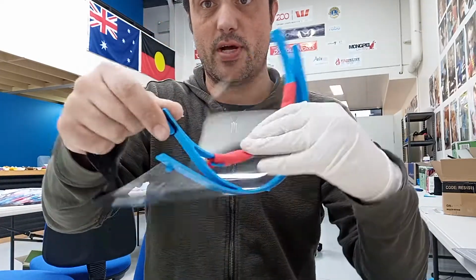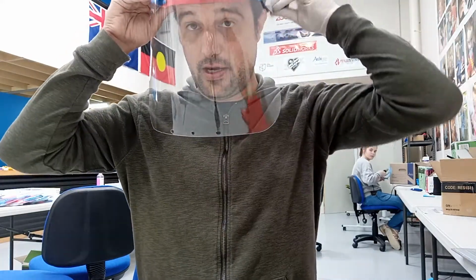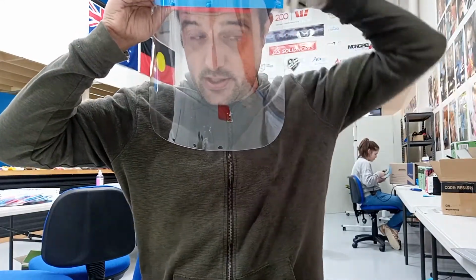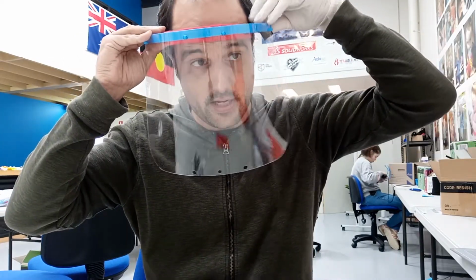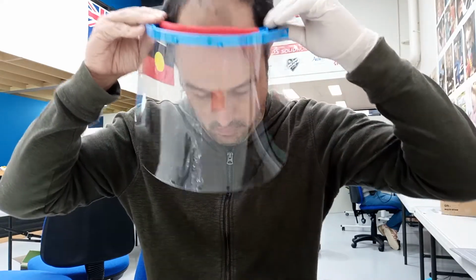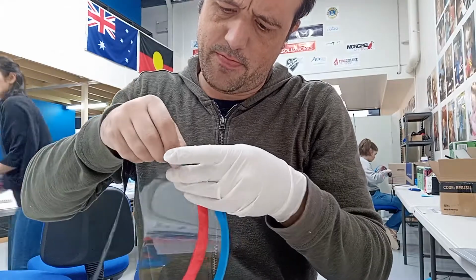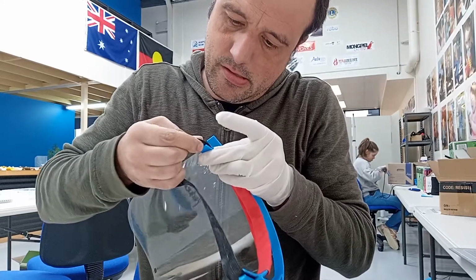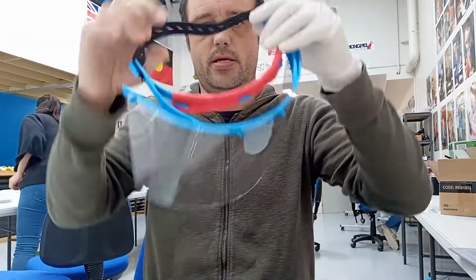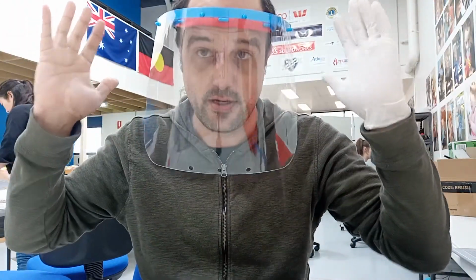Right, once that first one's on, you can actually do a test fitment to the face and find out which hole is going to actually be most comfortable. You don't want it too tight and you don't want it too loose. That'll depend on the size of your noggin. So in my case, I've got a bit of a protruding forehead. I'm on the second hole here. How's that? Yep, that's nice and comfortable. And it's sitting by itself and it's not moving. I'm going to move the head.